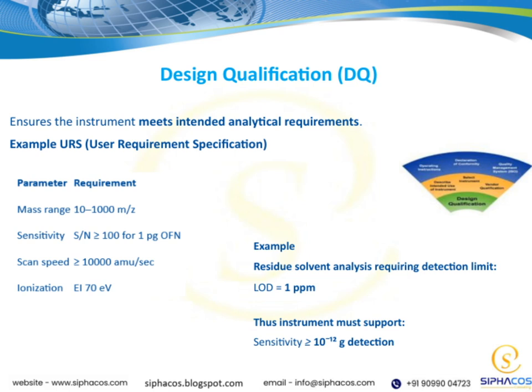So, in summary, setting these detection limits and qualifying the instrument through DQ and URS ensures we get reliable, precise results for residue solvent analysis. It's all about making sure our tools are up to the task for such demanding analytical work.